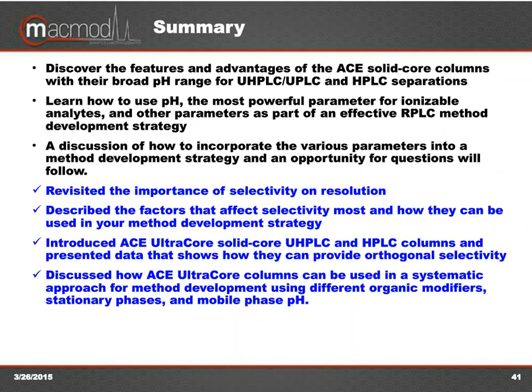Finally, to summarize the objectives that we had are up on the top of the slide, and basically we've revisited the importance of selectivity on resolution and talked about the factors that affect selectivity the most based on actual research done by Snyder et al. And we talked about how they could be used in your method development strategy.